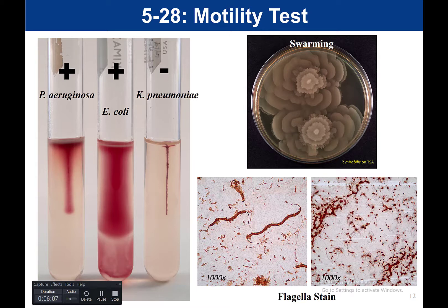These would be our results. You do not need to memorize which organism gave which result, but if shown a picture of one of these tubes, you should be able to tell whether it's motile or not. It's not just the red — both positive and negative are red. It's where the red is that matters: along the stab line, or did it migrate away? What we're seeing here is a phenomenon called swarming. Proteus mirabilis is very motile — highly motile — and when it grows, it gives this unique ring-looking structure because of this swarming.